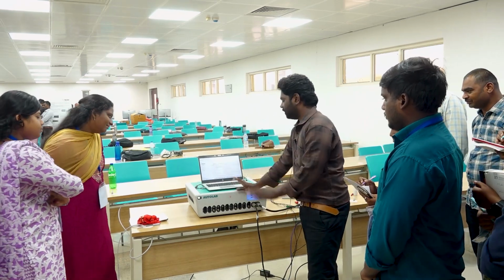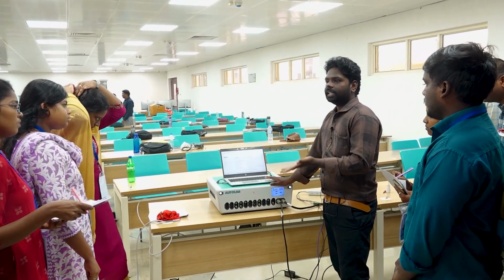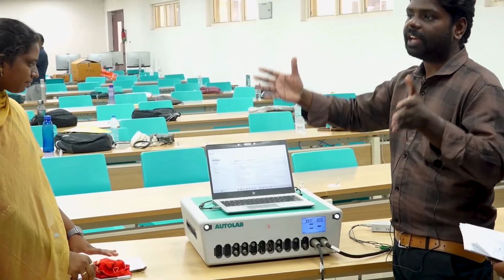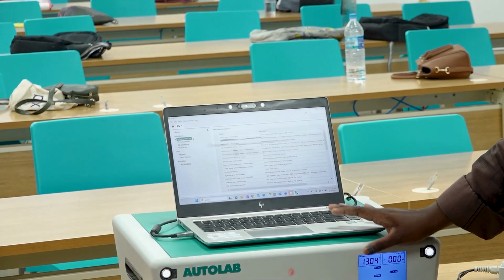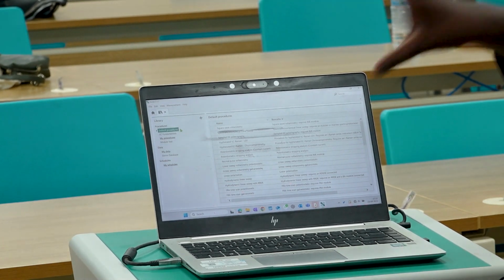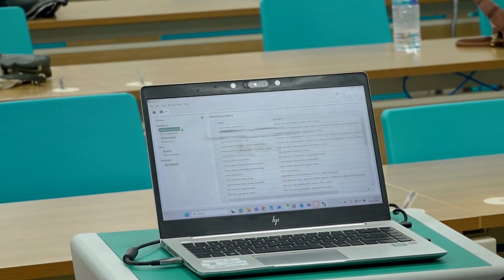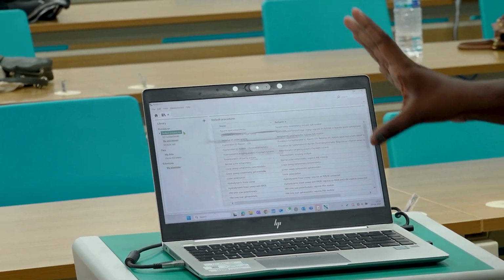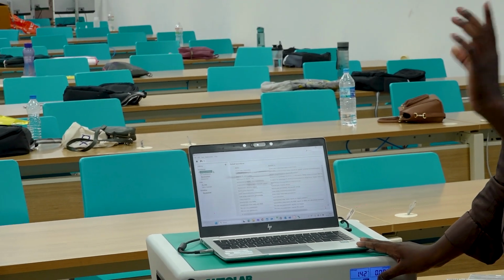Now this is the electrochemical workstation, as I said earlier. This has an EIS measuring range of 1 megahertz to 10 microhertz. Each instrument has different measuring ranges. We are going to sweep the frequency. We apply a frequency as input, but actually we sweep from high frequency to low frequency. At each frequency, the data will be recorded, so that we can analyze it. So 1 megahertz to 10 microhertz.